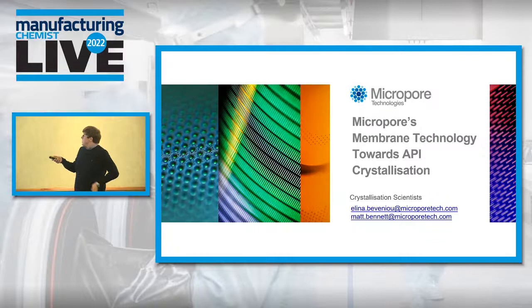So what I want to tell you is the work that's been carrying on out at Micropore Technologies, in particular, our work in API crystallization.